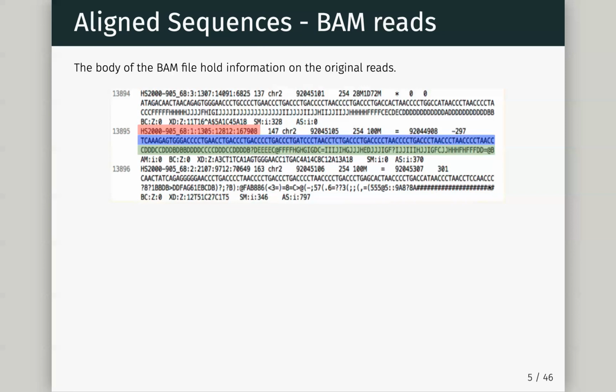Hopefully we've trimmed out poor quality reads, but the aligner will take care of low quality. It does this either by ignoring the bases, down weighting them in the alignment, or sometimes it will just trim them out as we go. So it won't use that part of the read for alignment. We'll use the rest.